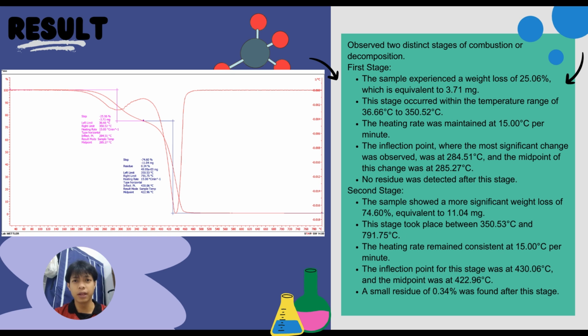The inflection point with the most significant change observed was at 284.51 degrees Celsius, and the midpoint of this change was at 285.27 degrees Celsius. No residue was detected after this stage.